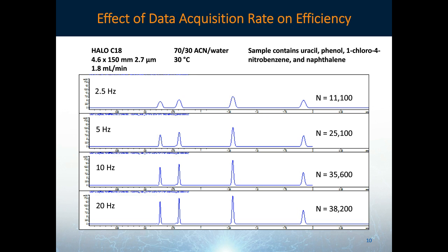Going from 5 to 10 Hz, you still see a fairly significant increase in plates of 41.8%, and the plates go up to 35,600. And then finally at 20 Hz, you're up to 38,200 plates, with a 7.3% increase over what you had seen at 10 Hz.